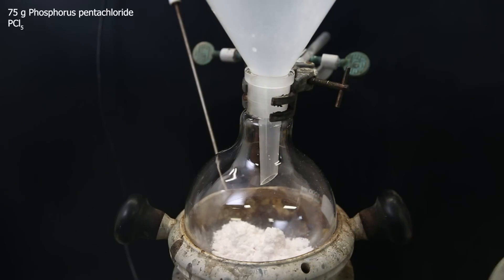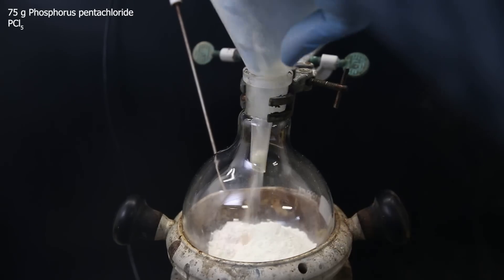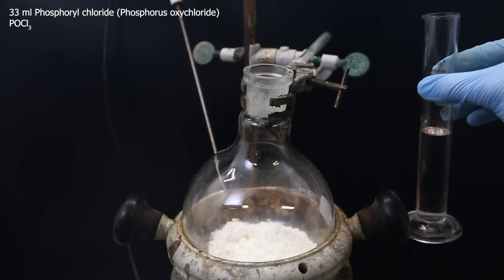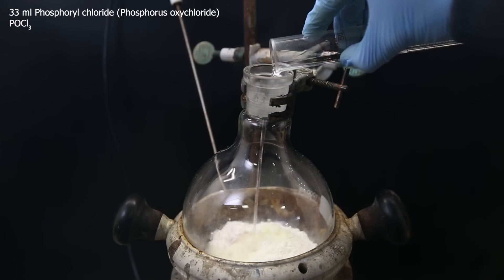So first, I weighed out 75 grams of phosphorus pentachloride in the same dish and add it directly on top of the material. I then add 33 mils of phosphoryl chloride also directly on top of it, without any solvent.